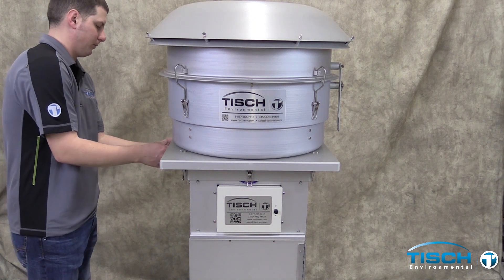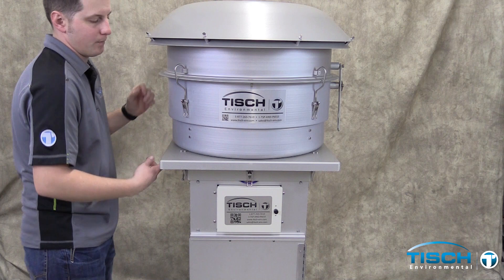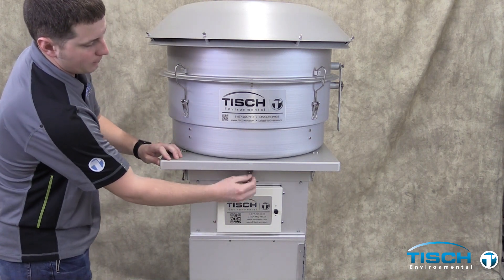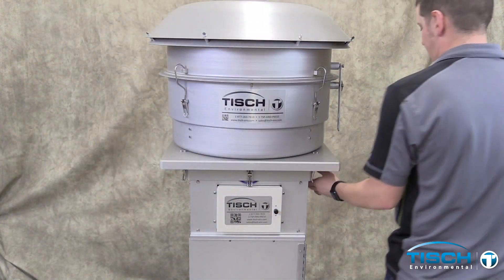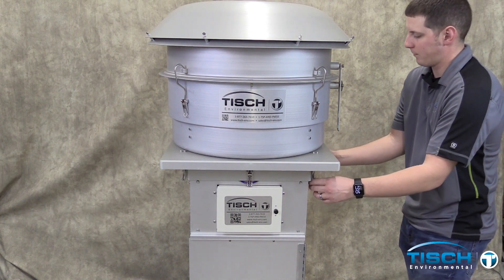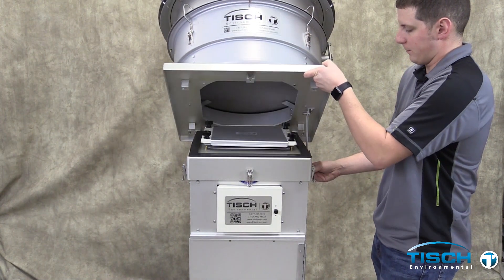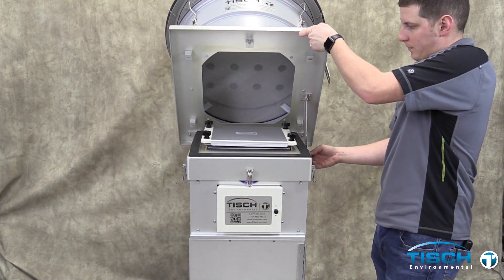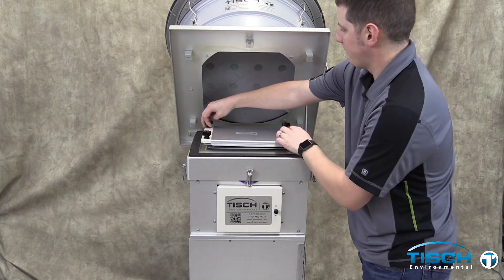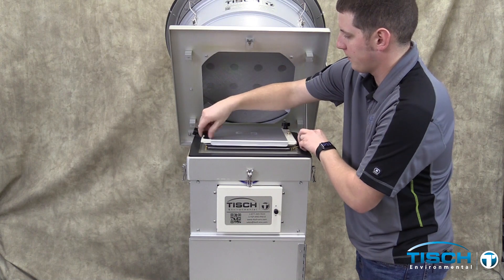Open the six latches. Raise the top of the inlet up and lock it upright. Loosen the four plastic nuts then remove the TE3000 cartridge.